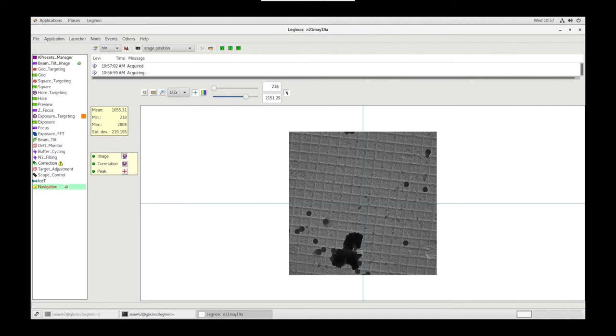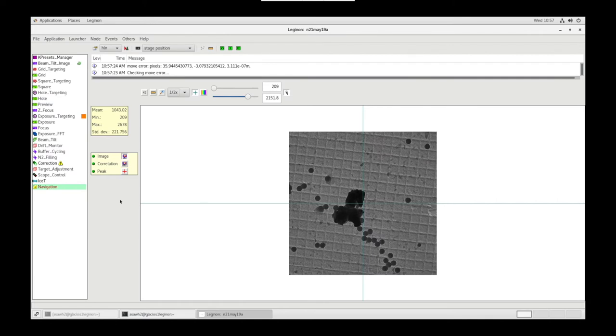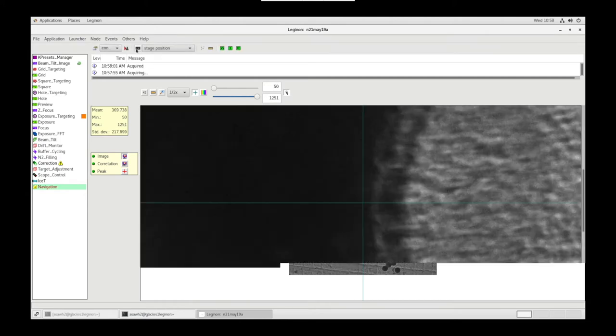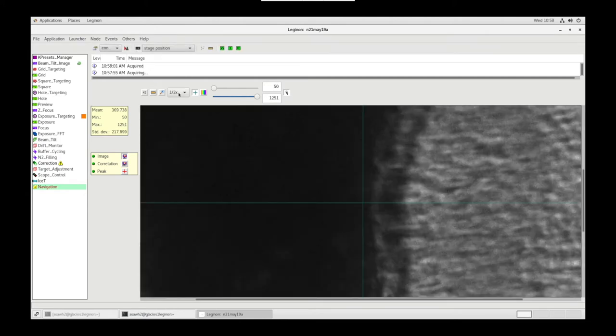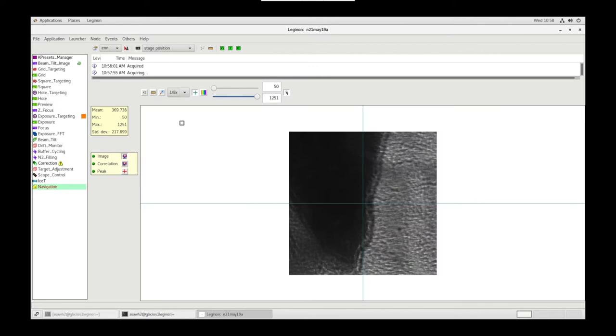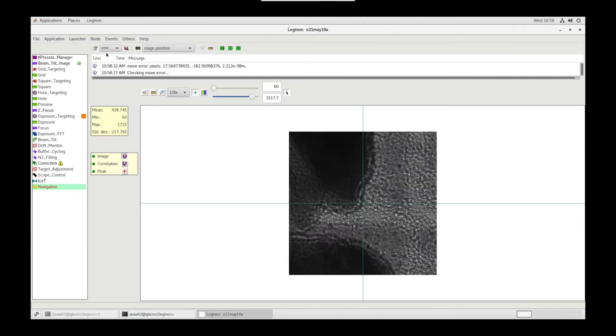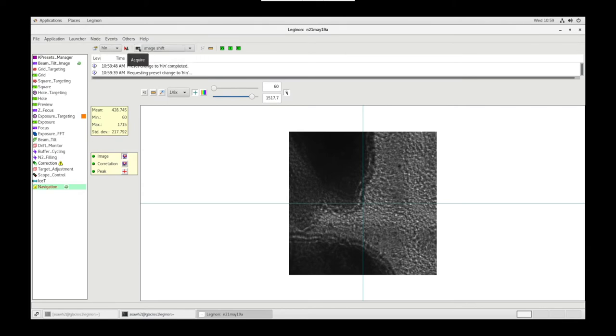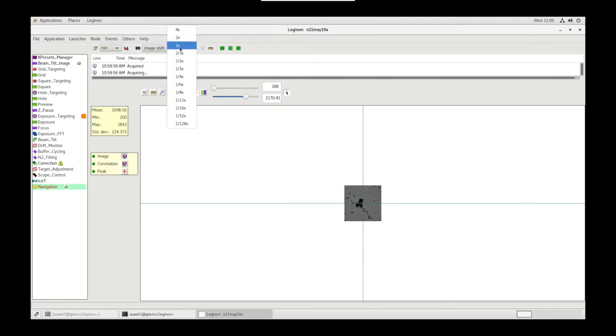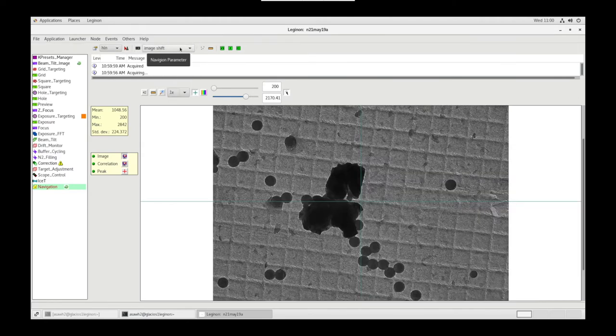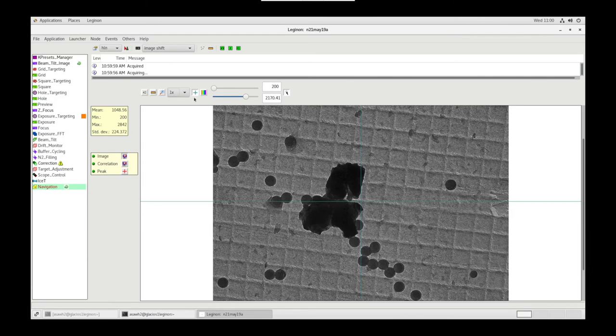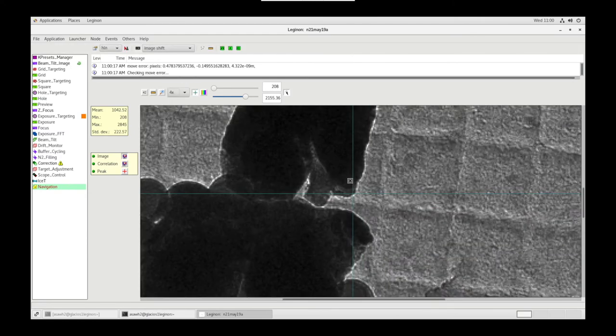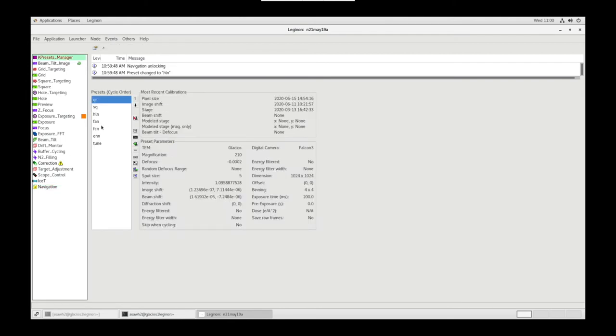We found our object of interest, now let's put the beam over it using the Cursor tool. Let's go up in Mag, let's go to ENN and Acquire. Let's find a particular spot on the object that we want to be over. I'm going to go to the tip of this odd looking thing, and we're going to go down in Magnification to Hole and use Image Shift to Acquire Image. Now I see that we're not there, so let's use our Cursor tool to actually go to the same location that we were in ENN.